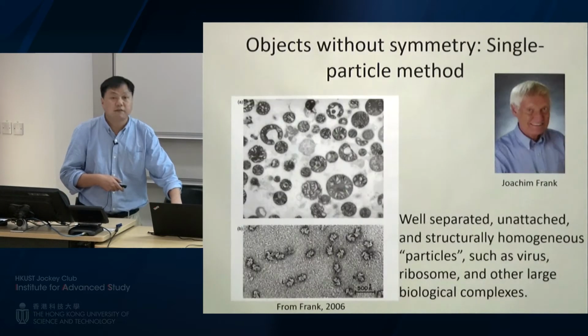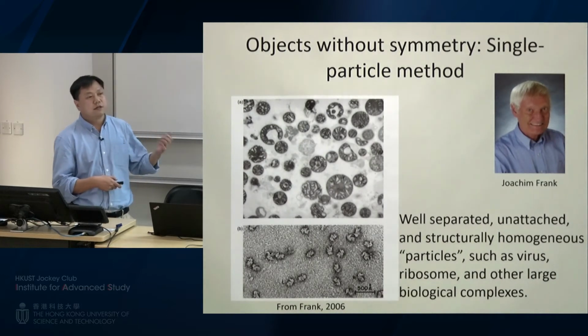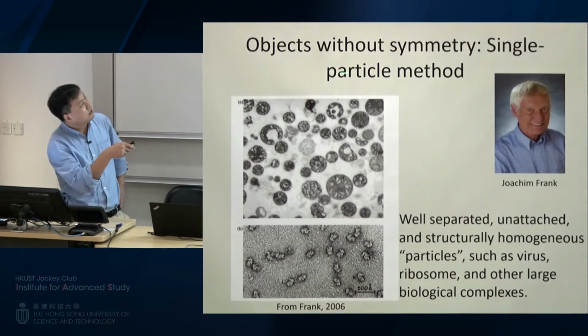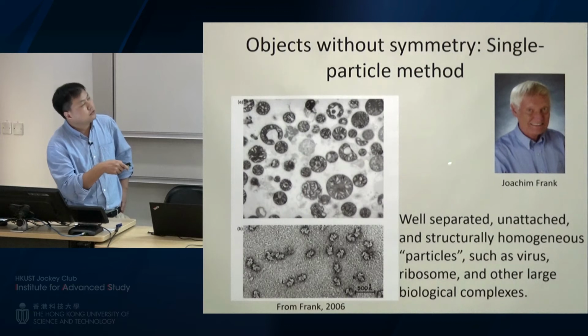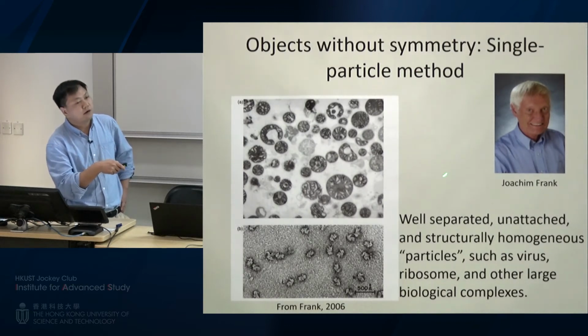Now you have seen a few examples. All of them are either crystals or highly symmetric molecules. But how about objects without symmetry? Joachim Frank, who is also my PhD advisor, was one of the first to have the concept of the single particle method.